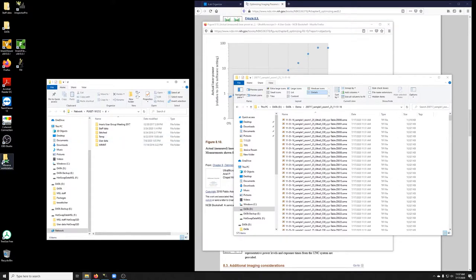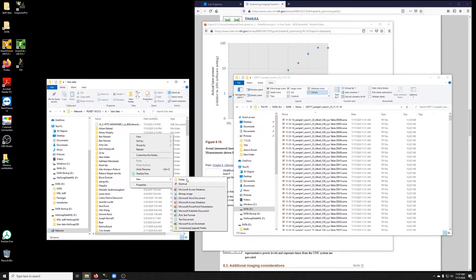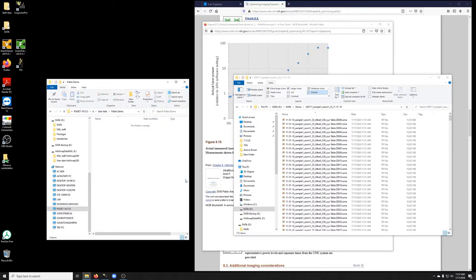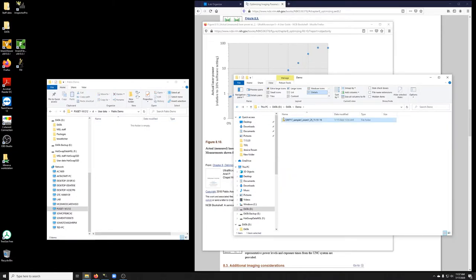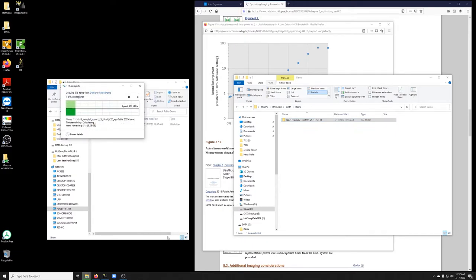The way you do it is you double-click here, go to user data, and make a folder for yourself. I'm going to call it Pablo demo. Then you just drag over whatever you want to copy.